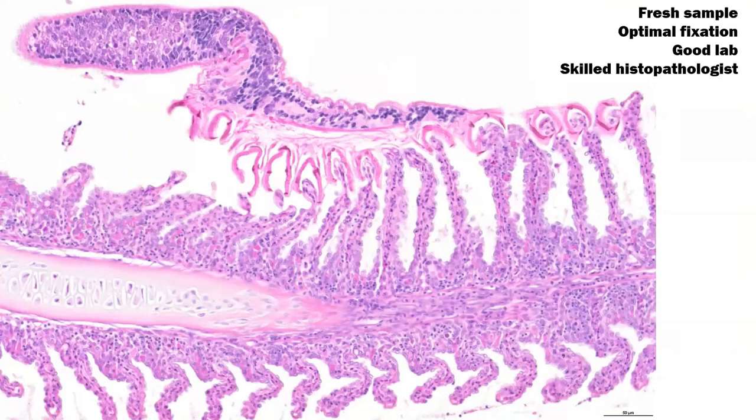I believe that you also think that this image shows a very good histological preparation. And for the record, the image shows a specimen of Sparicotyle chrysophrii, for those who did not recognize it.